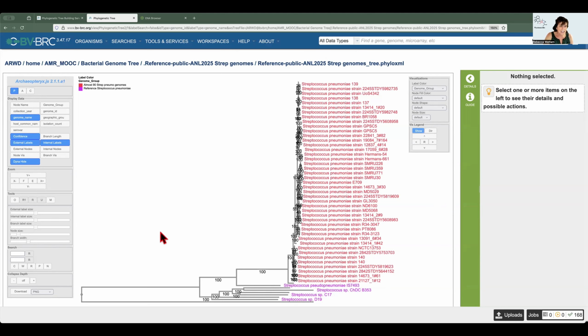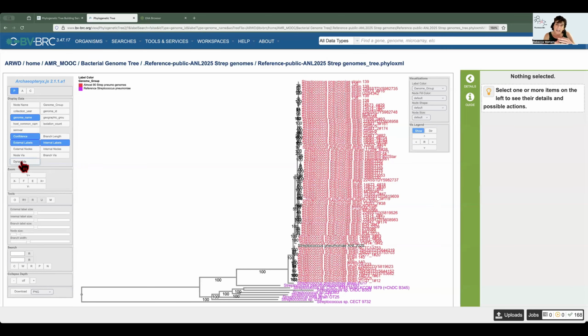And you can see, it looks like some of them are missing. So over here, you can click on this thing called DynaHide and include that. It's trying to give you a nice looking view. And you can see all of them here, and suddenly you can see, oh, here's the private genome, sort of, it's my private genome, and you're going to run this too and see it with your private data. But you can see that the public genomes are all clustering together.